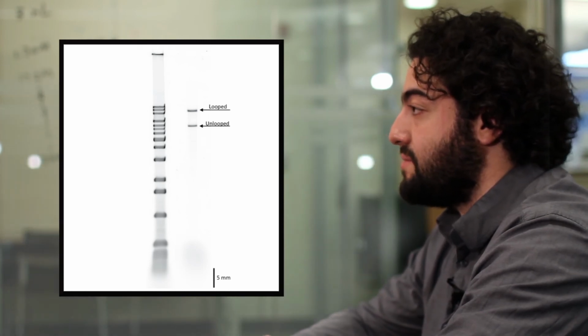This is an image of a gel prepared, run, and stained under these conditions, showing where the looped and unlooped bands appear relative to the 1 kb extension ladder.